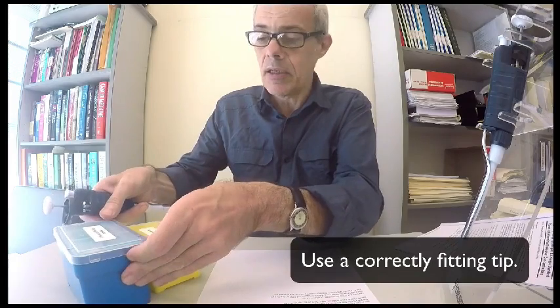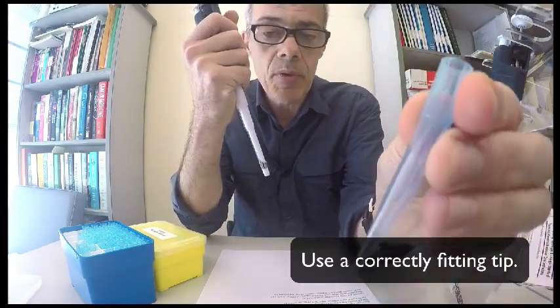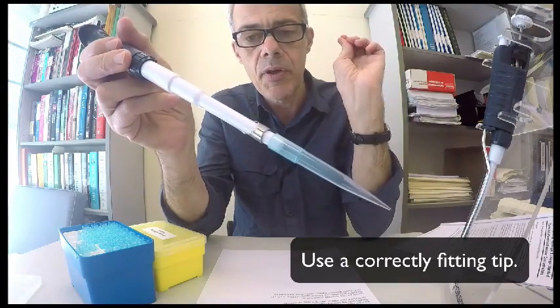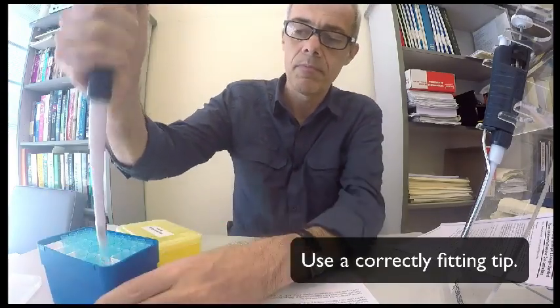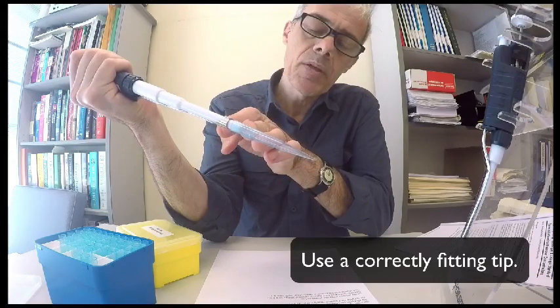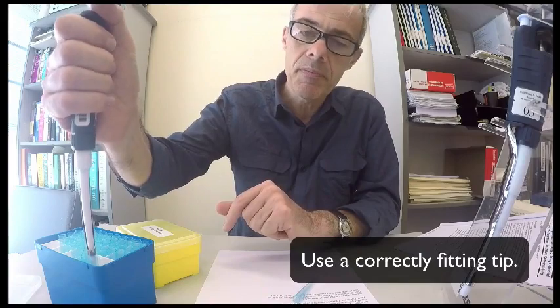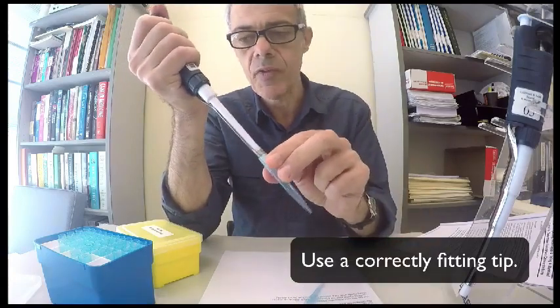So here is a box of tips. This is what a blue tip looks like. These tips fit the P1000, and you'll notice that the diameter here matches the diameter here. So it just clips on, all right? So effectively, what you do is just lightly put it on, okay? This large plastic tip fits the P1000, okay? If you try to take the P200 onto the blue tip, it's not going to fit, okay?